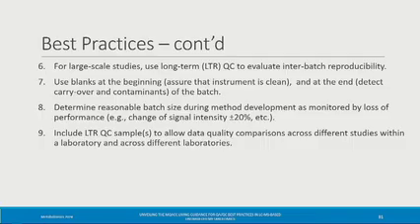So that's why you are right. You saw blanks and system suitability sample. Both of those are run together. Blanks to test for instrument contamination before you start, and system suitability to check retention time, m/z, instrument stability, and so forth. So yeah, they're usually run back to back.